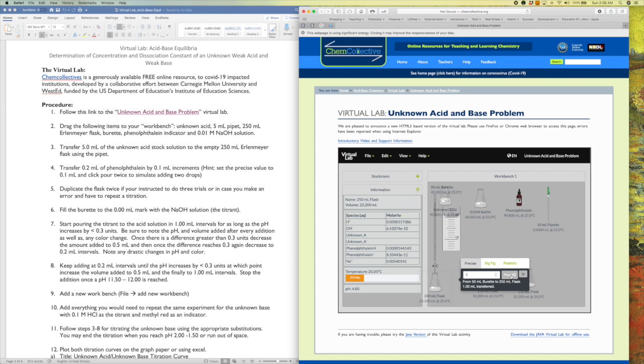So we're at 4.8 and now 4.85. So the increments by which the pH is increasing are still fairly small. So we're still good with 1 milliliter increments. And that's okay. And again by 0.05, so I keep on adding. That went up by 0.04. And I'm keeping on adding, right? That was 0.05. That's 0.05. I'm going to keep adding.